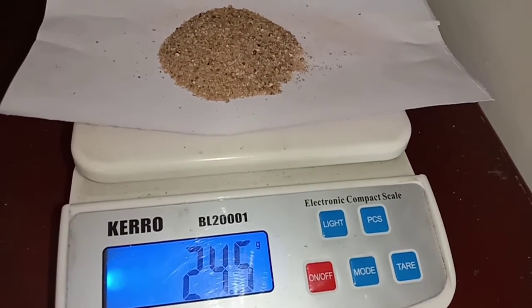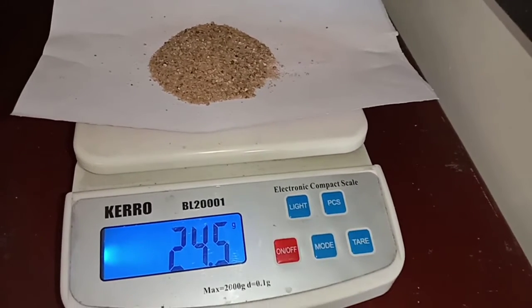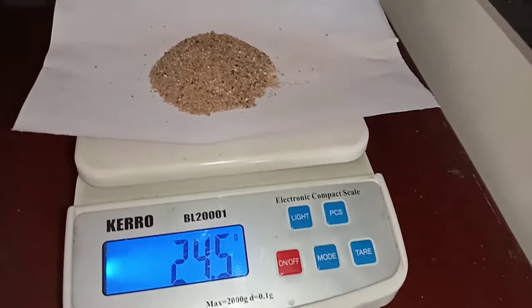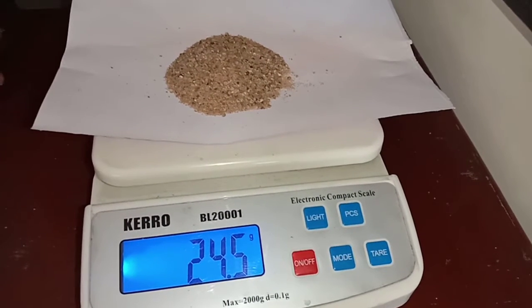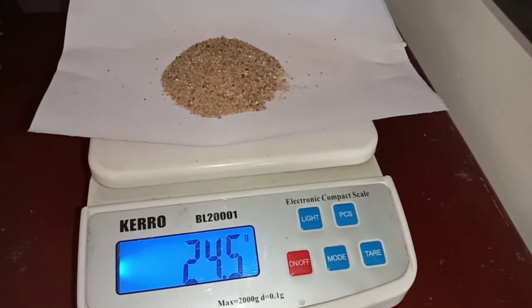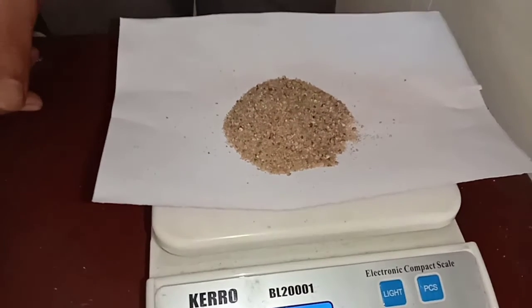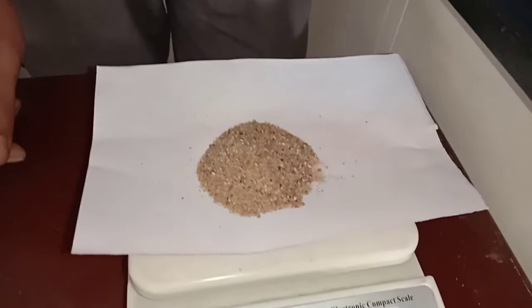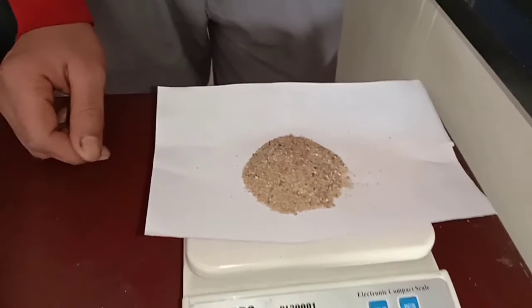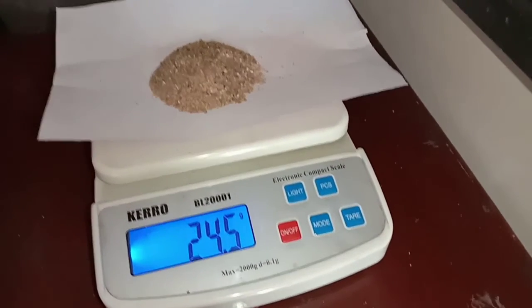We have to calculate the two different readings to know the moisture content of the soil. So for sandy soil, we get 24.5 grams measurement after drying it. And for the clay soil, after drying it, we will get 23.5 grams of soil sample. Okay dear students, so like this we can calculate the percentage of moisture content. For that we have to know the weight of water or the moisture in gram, or we can say we have to find the difference between the initial reading and the final reading.